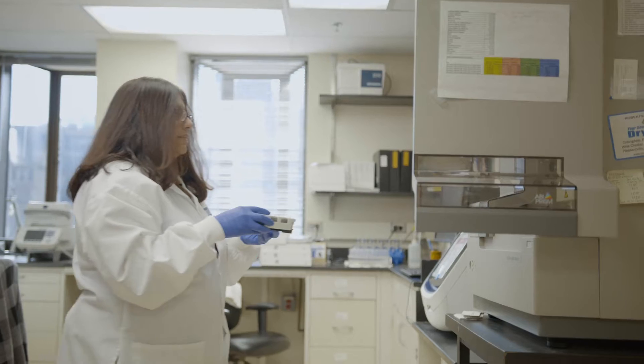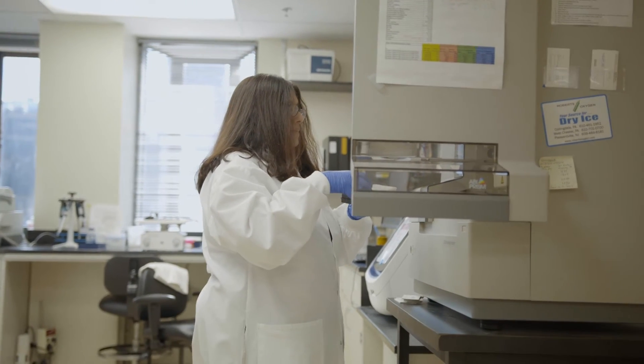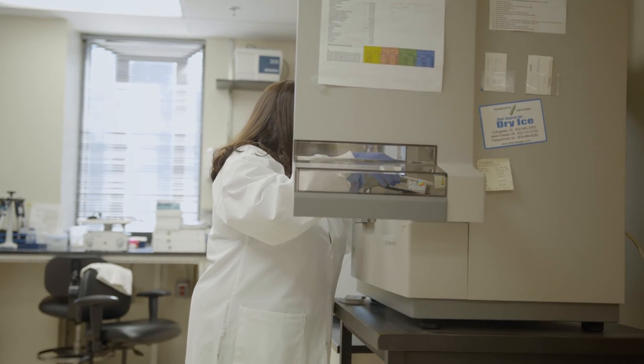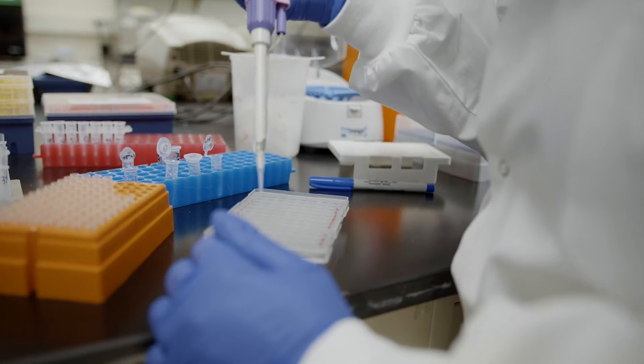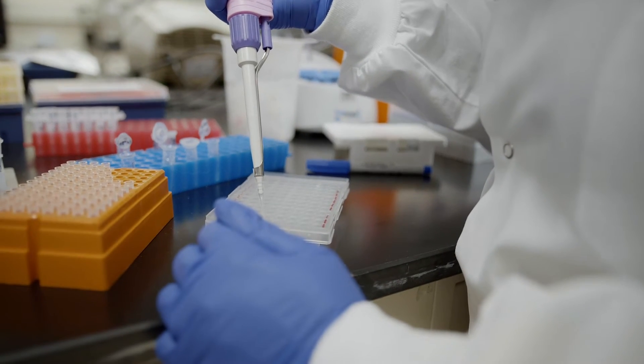So a scientist may be interested in a particular gene, and they may have isolated that gene and just wanted to check the sequence of that gene to see if there are any mutations or anything else. So they would then clone it into a vector, give it to us, and we would get the sequence of that gene using this machine.